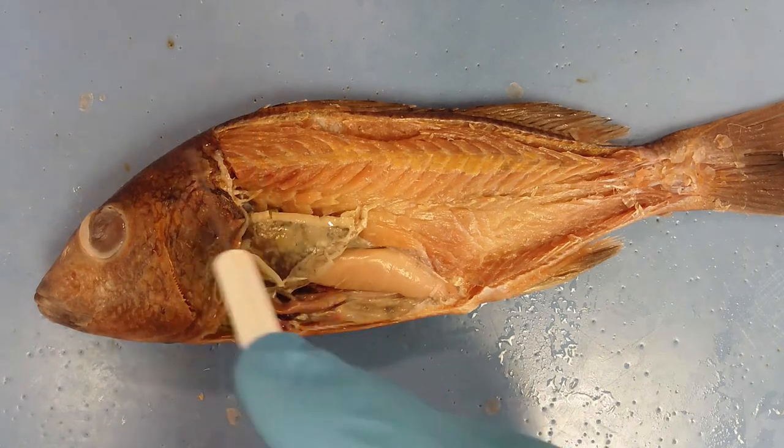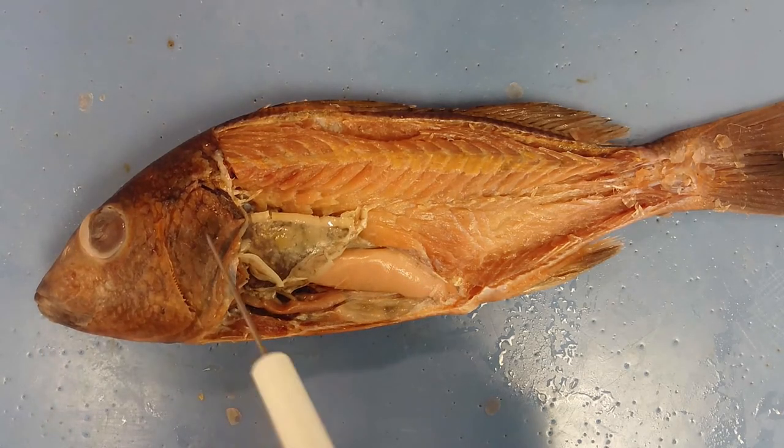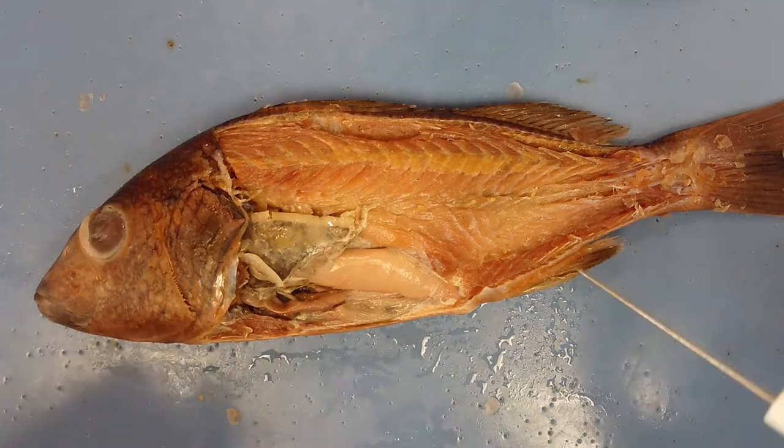There is a lot of muscle in the rest of the head, underneath the chin, in order to control the movement of the jaw and the pharyngeal teeth.